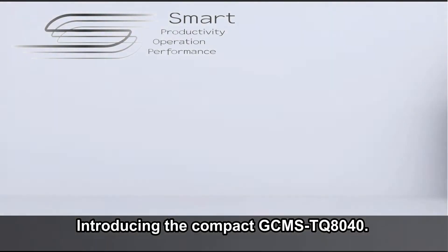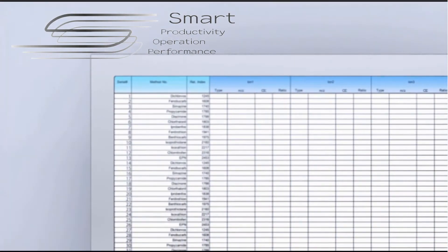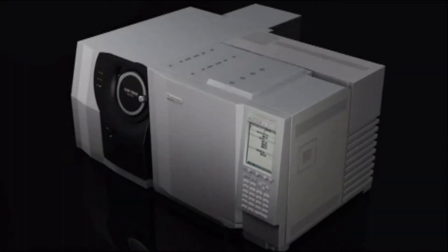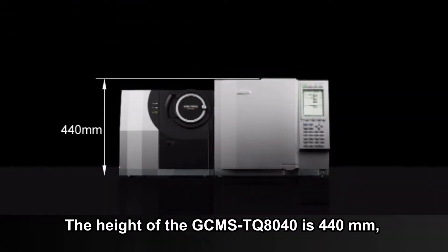Introducing the Compact GC-MS TQ8040. The height of the GC-MS TQ8040 is 440 mm, the same as the GC-MS QP 2010 Series single quadrupole instruments.